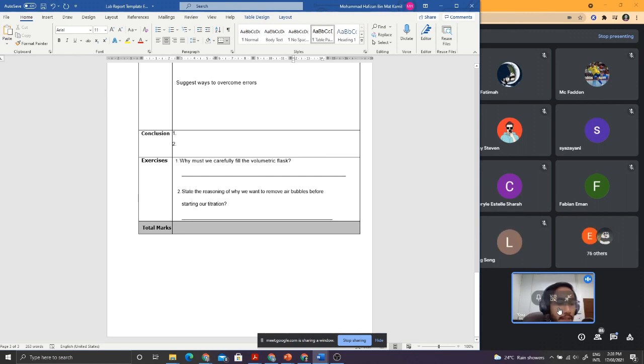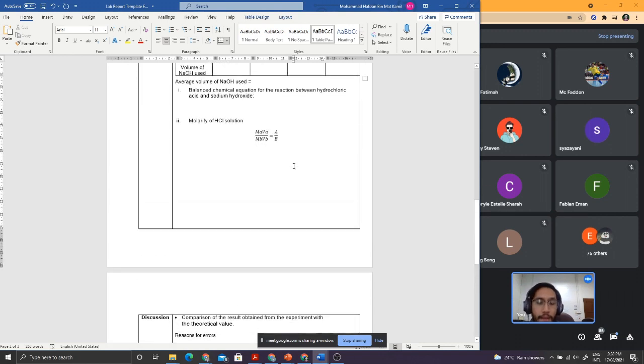Yes, phenolphthalein is just an indicator. So phenolphthalein kita tak masukkan dalam reaction. Okay, phenolphthalein you masukkan just to know that kita nak detect the kehadiran salt lah. Sebab kalau if you ingat, NaOH campur dengan HCl, you akan dapat salt. You akan dapat NaCl, which is your table salt.